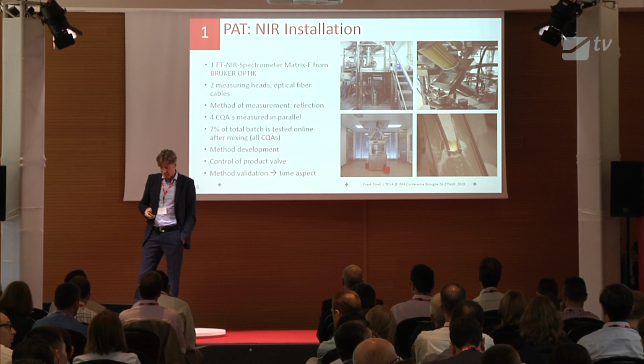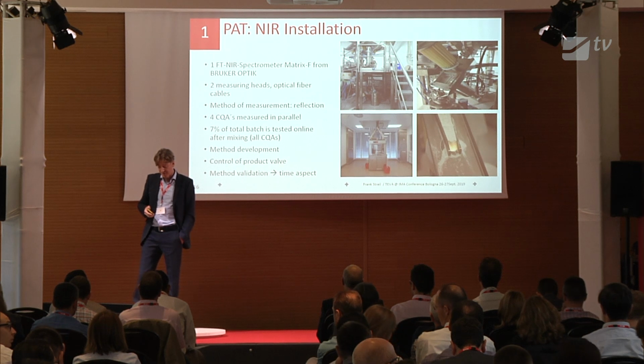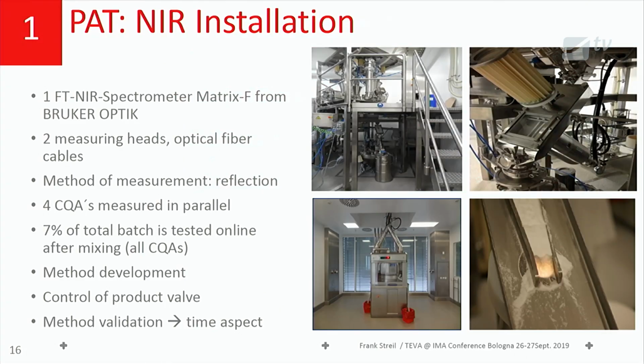But you need to be aware that method development, which I will cover a little bit more later on, is much more complicated for such a process than for a batch process, and especially the time aspect needs to be considered for this application, because it makes a difference if you measure at the beginning of the batch, and our batch runs roughly 3 days, or at the end of this batch. So you need to assure that those values are comparable. If you go for batch release testing, you always have the same sample.